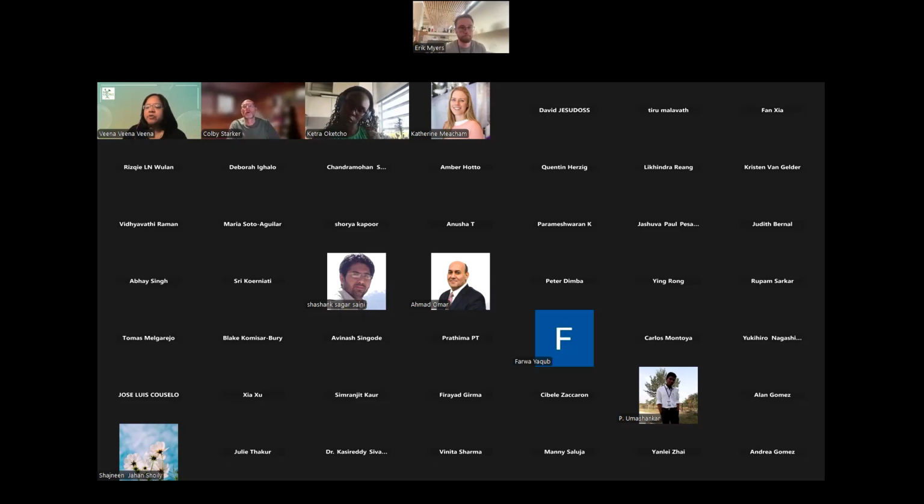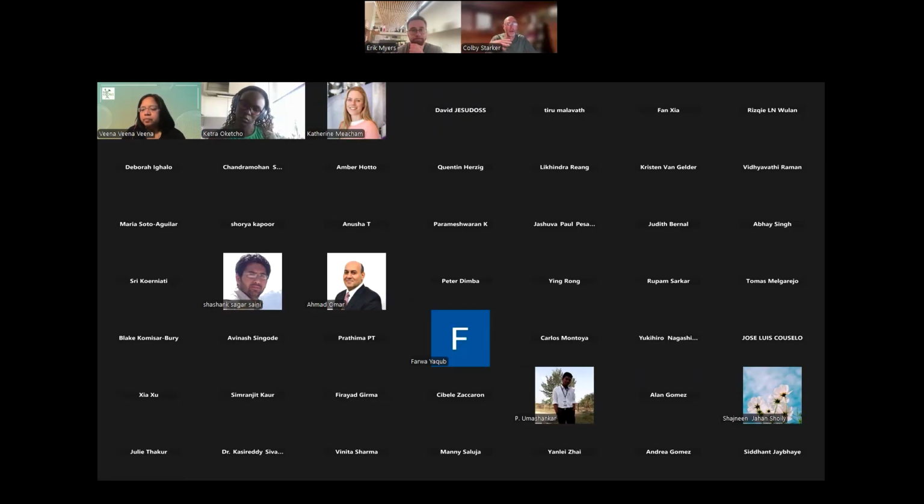There is a question by Risky. If you have an option to choose between U6 and U3 promoter, how will you make a decision about choosing one or the other? I can answer this pretty easily. We actually published a paper in 2017 where we compared U6 and U3. These are the Arabidopsis versions, and the U3s don't seem to work as well, basically.